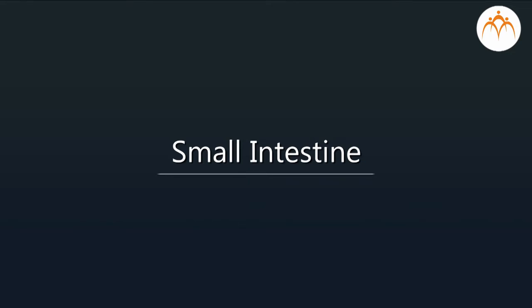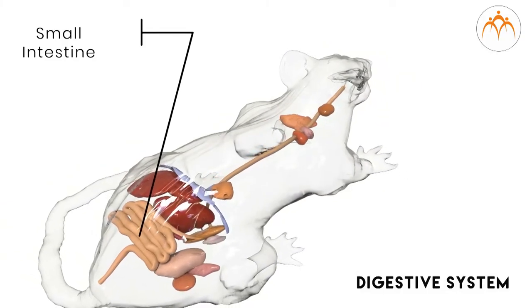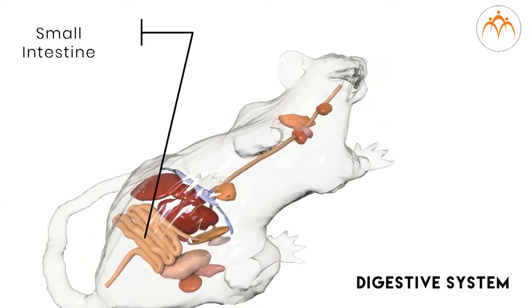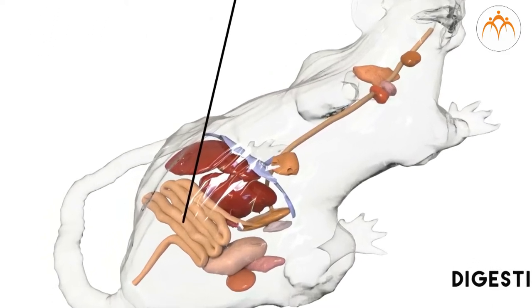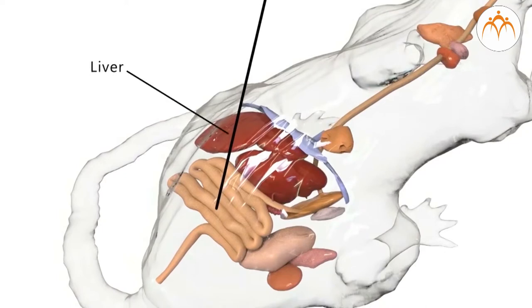You can see the small intestine has a long coiled tube. The human small intestine is also a narrow elongated tube. You can see that the liver and pancreas are connected to the small intestine. Here, food is completely digested, including breakdown of fats, oily substances, proteins, and carbohydrates.